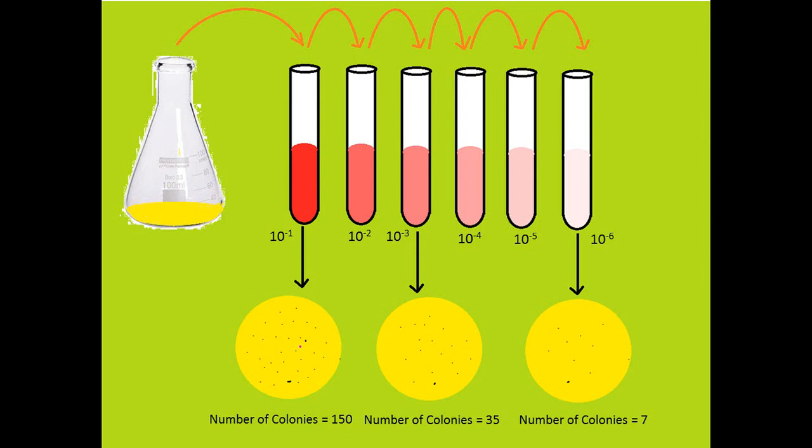In the spread plate technique, you distribute 0.1 ml of the sample over the solidified media, incubate it for 24 hours, and count the number of bacteria.